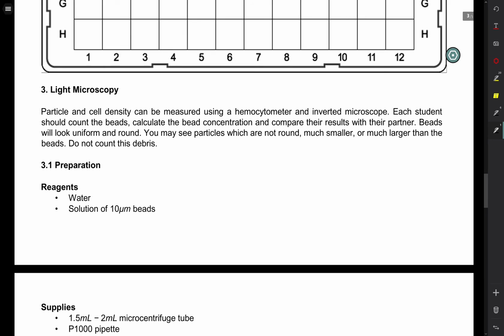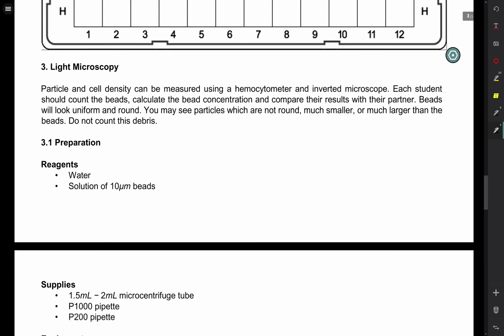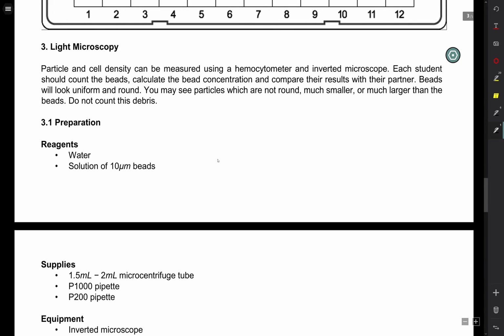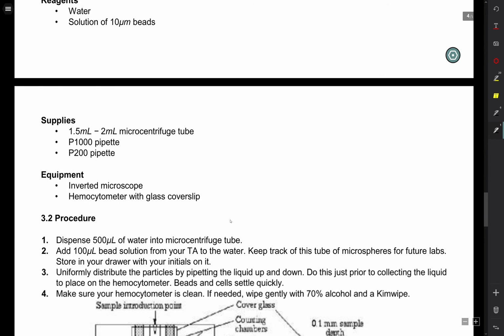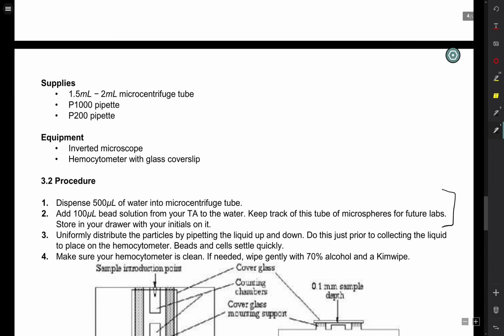After you finish this part of the lab, you're going to be counting some beads using the hemocytometer. Your TA will have a solution prepared for you, and you're just going to want to follow the instructions and pipette 100 microliters of that solution into your own 500 microliter aliquot of water. You're going to be using these beads for the rest of your time in 167L, so just make sure that you keep them safe and keep them in a place where you know where you can find them.